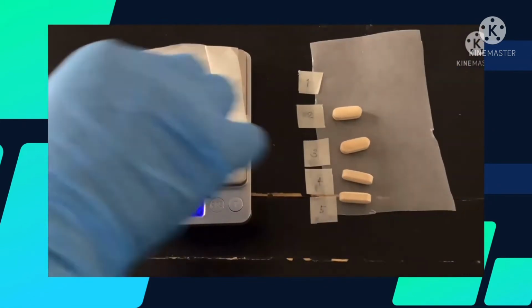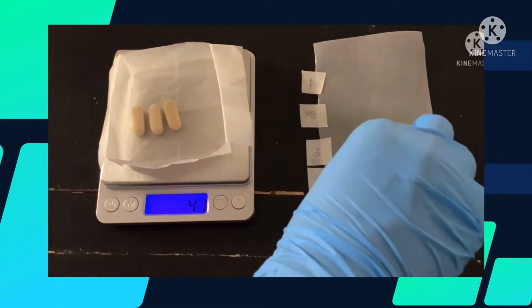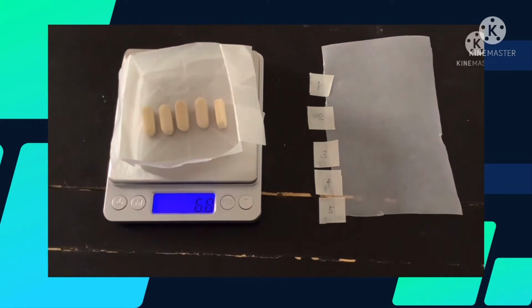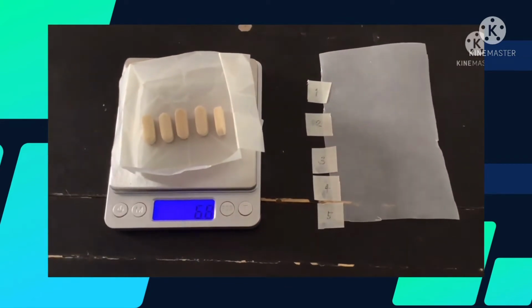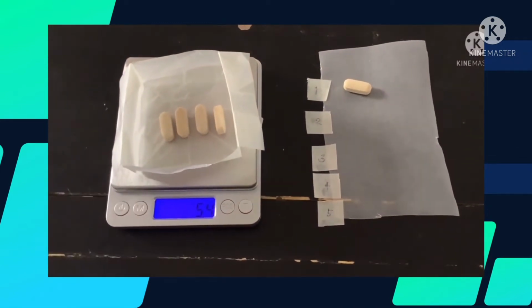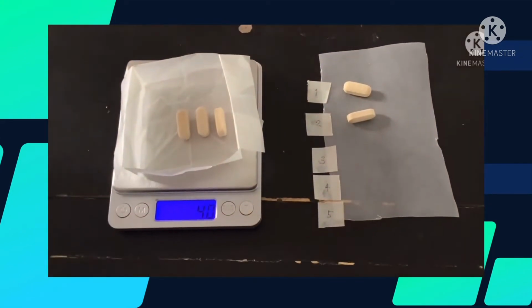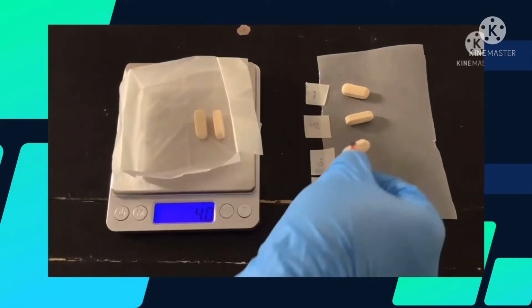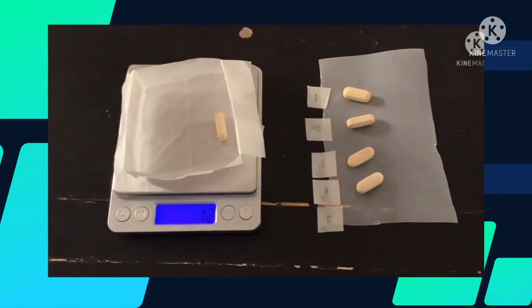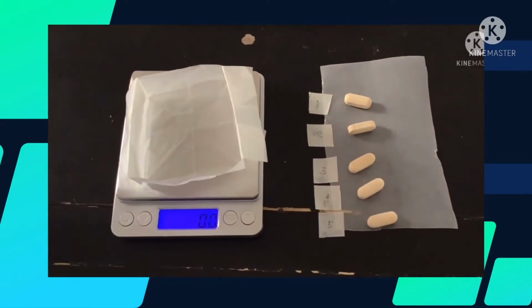Set the balance again to 0, and this time, place all 5 tablets and record the total mass. Remove each tablet, one at a time, and record each reading. Repeat this process by returning the tablet and removing it again 3 times to make 3 readings. Determine the mass of each tablet removed by difference and record it in your notebook. Compare your results using the 2 methods of measurement.